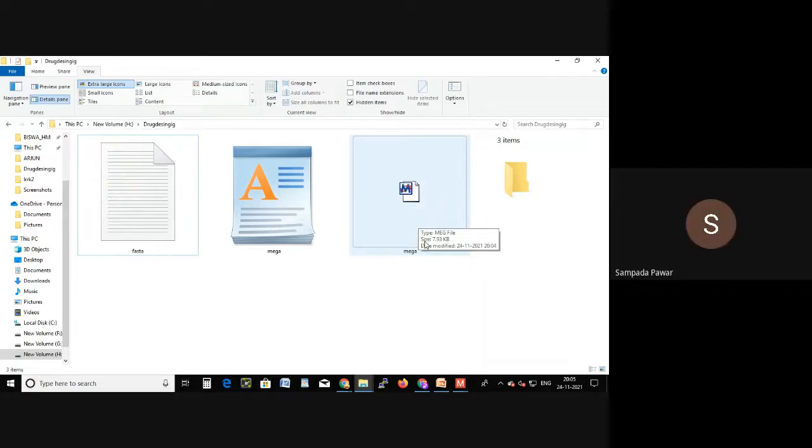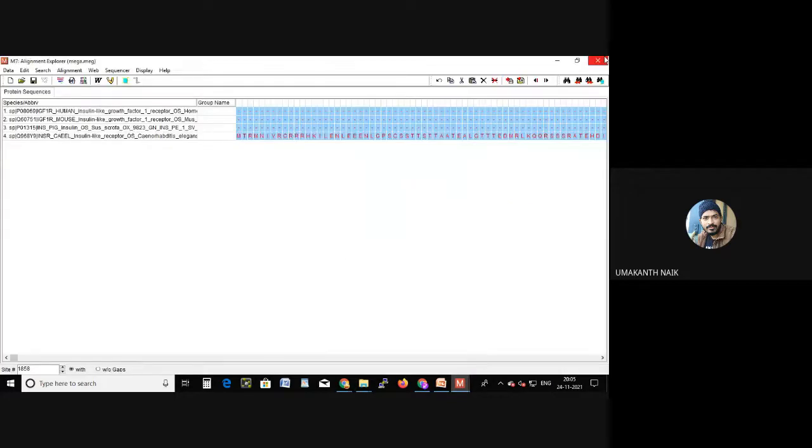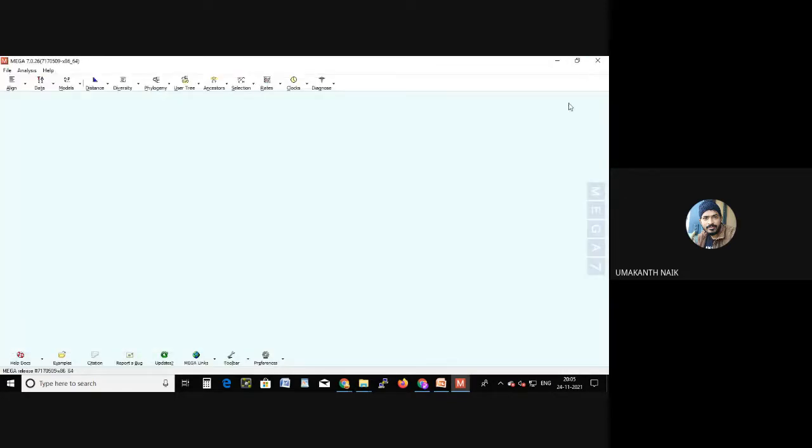Yes, sir. Fine. Okay. So now what I'm doing? See here. Just close this file. This dialog box, which has been opened, I just closed.